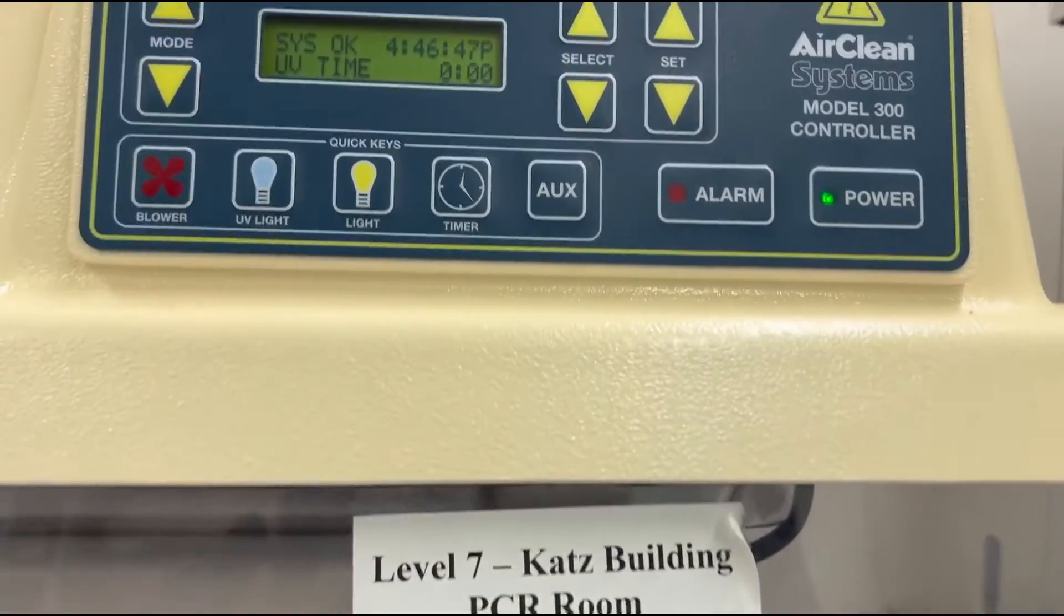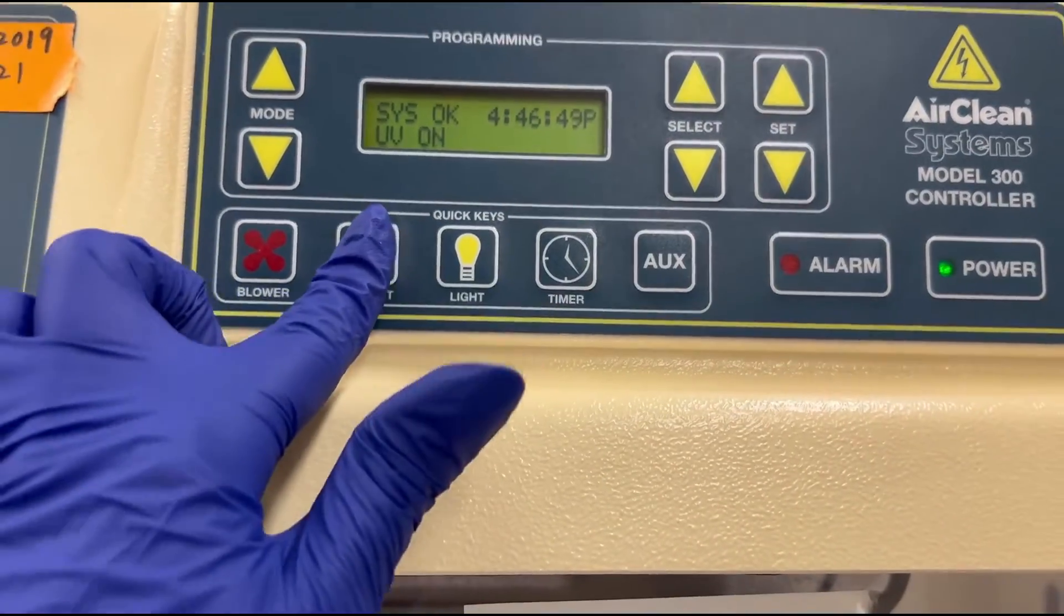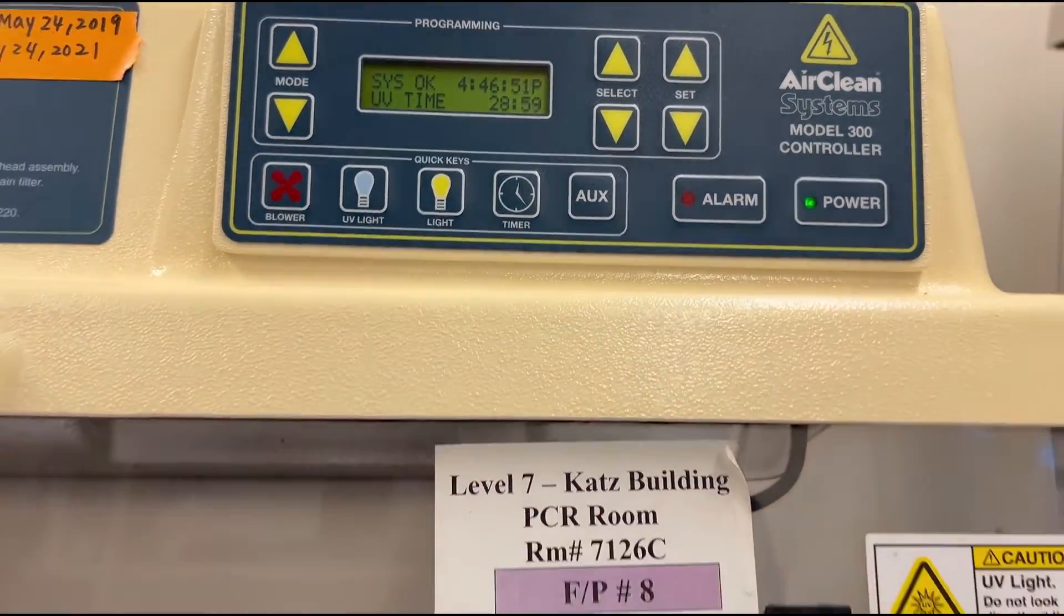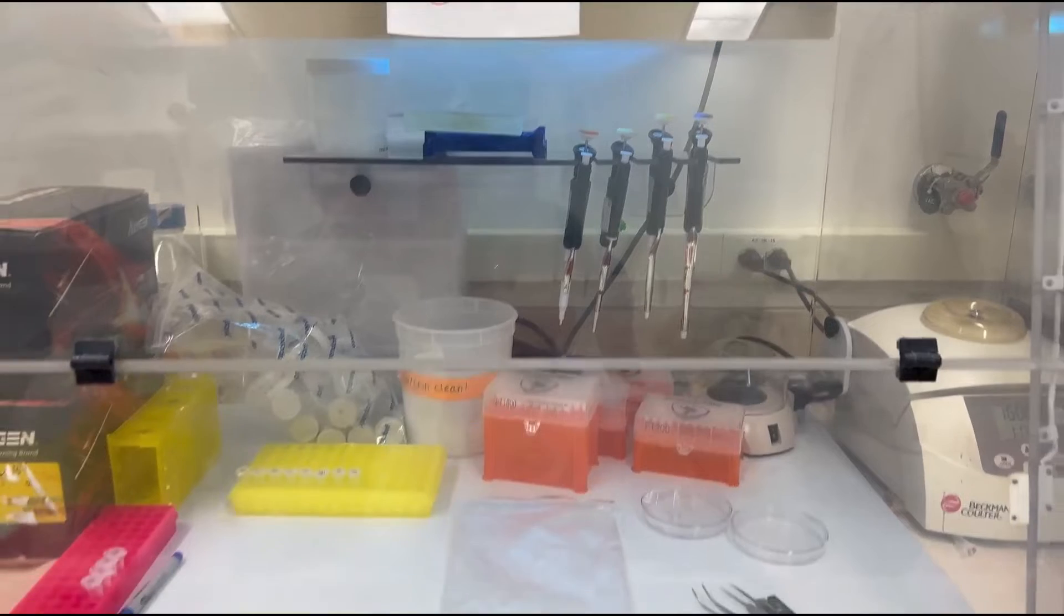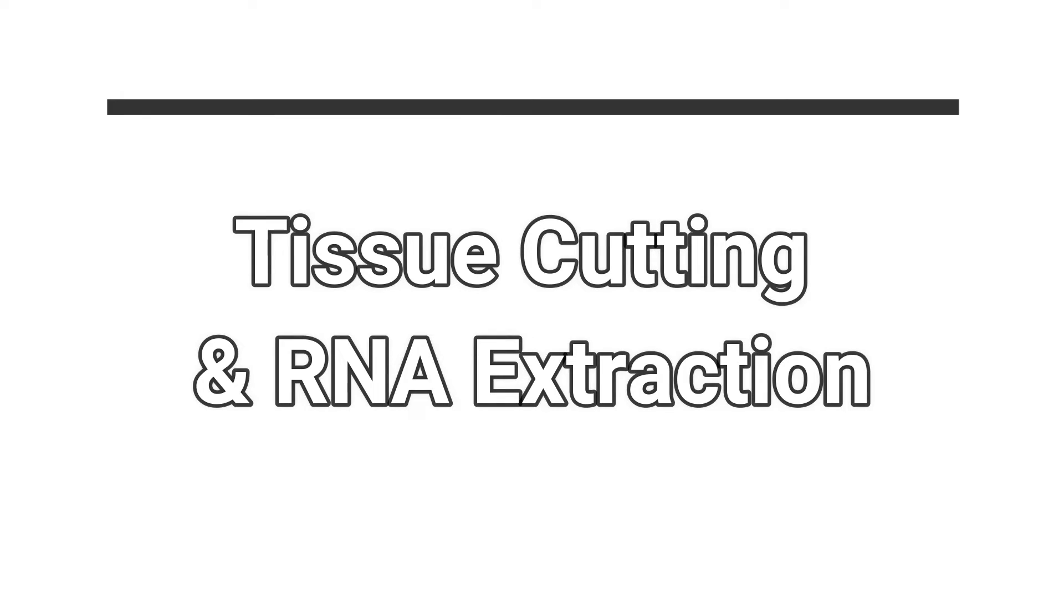And before we move on, let's activate the UV light for 30 minutes. This will help decontaminate the workspace further. With the workstation prepped, it's time to dive into the tissue cutting and RNA extraction process.